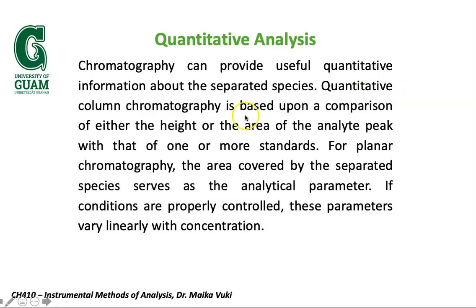The quantitative analysis is based on the comparison of either the peak height or the peak area of the analyte through comparison with the standards. For planar chromatography, the area covered by the separated species serves as the analytical parameter. If the conditions are properly controlled, these parameters can vary linearly with concentration.